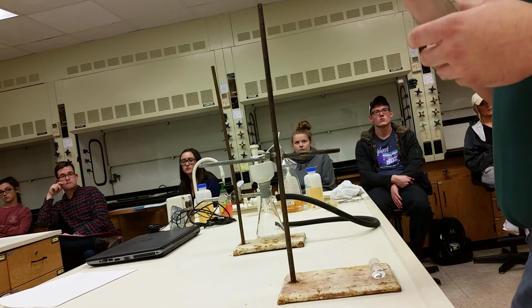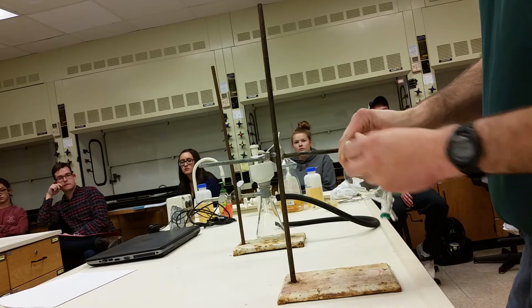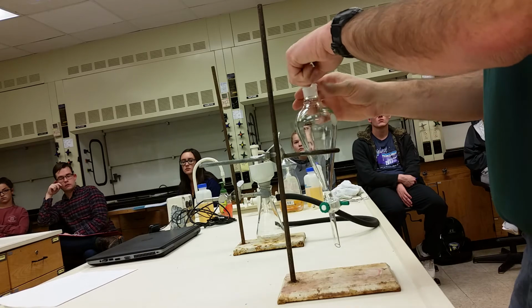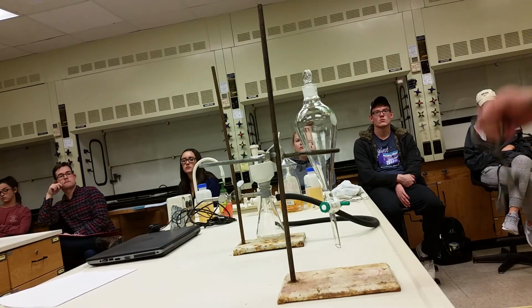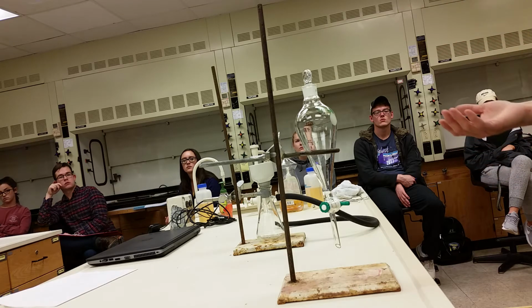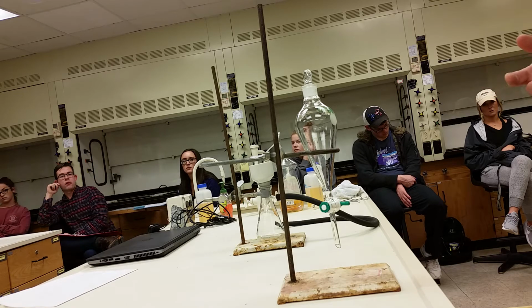You'll get your separatory funnel and the stopper. Okay? And you'll come over here to the drawer that says rings. You'll reach in here and you'll check to make sure that your separatory funnel fits inside the ring. If the ring is too large, your separatory funnel will fall through and crack and break, which is something we don't want to have happen. So you have to make sure it's the right size.